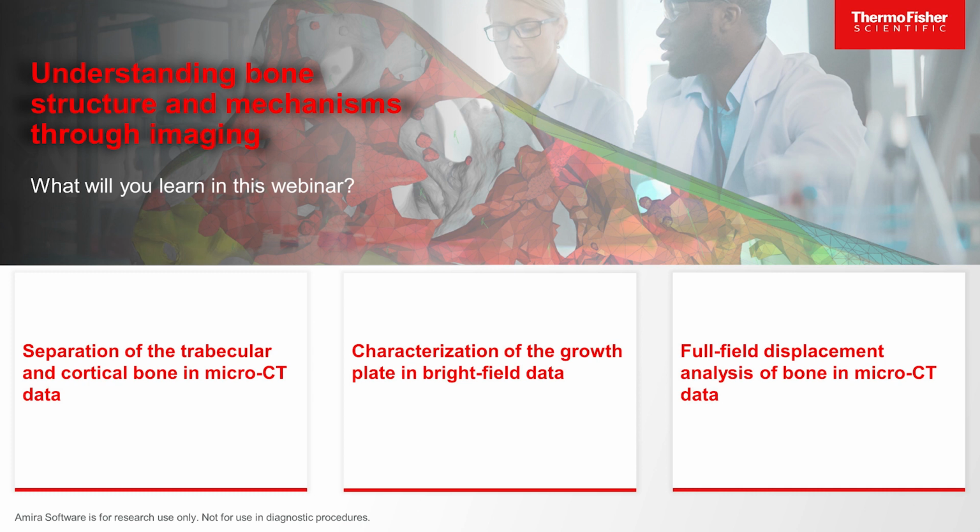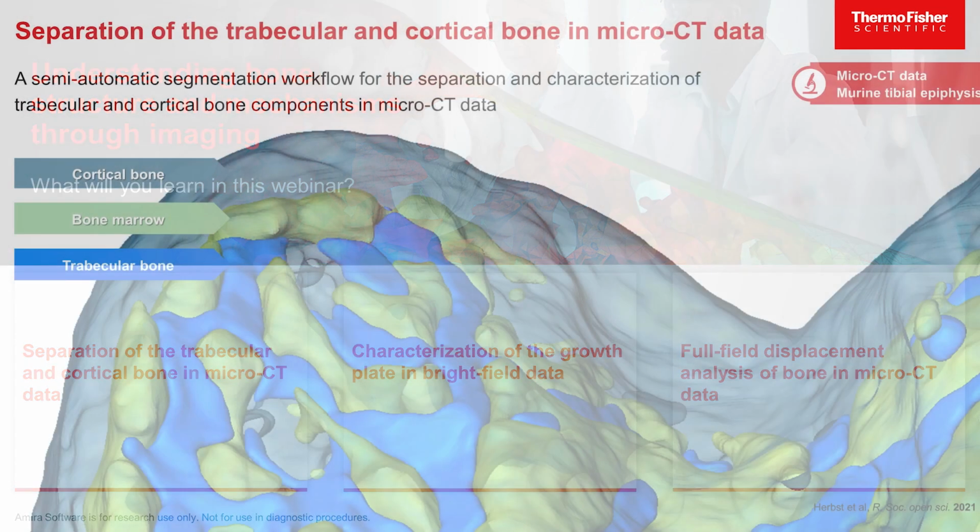We will talk about the characterization of the growth plates in bright field data, but we will also show you how full field displacement analysis of a bone upon deformation experiments can be performed, and this will be demonstrated on microCT data. But before Rosa starts with the actual demonstration of the product, let me briefly recall the individual use cases.